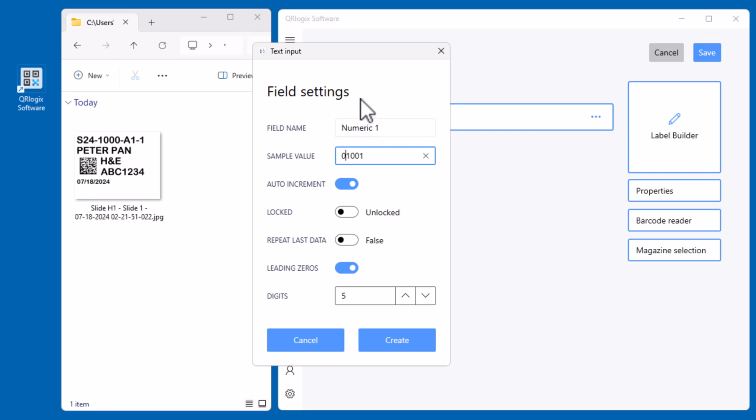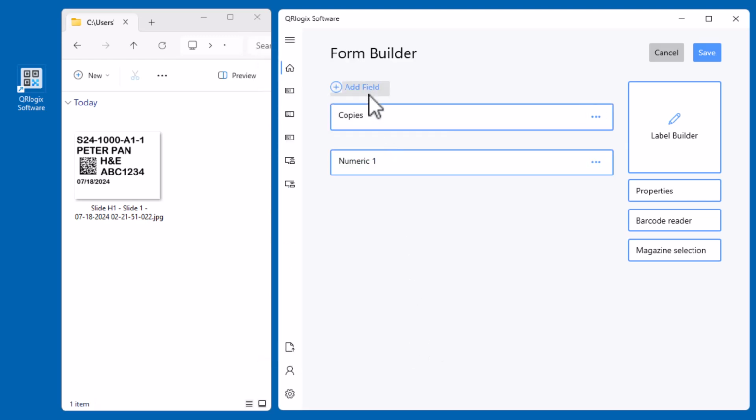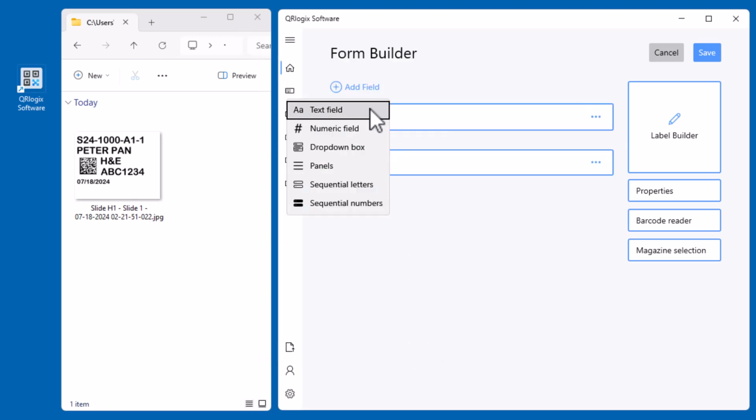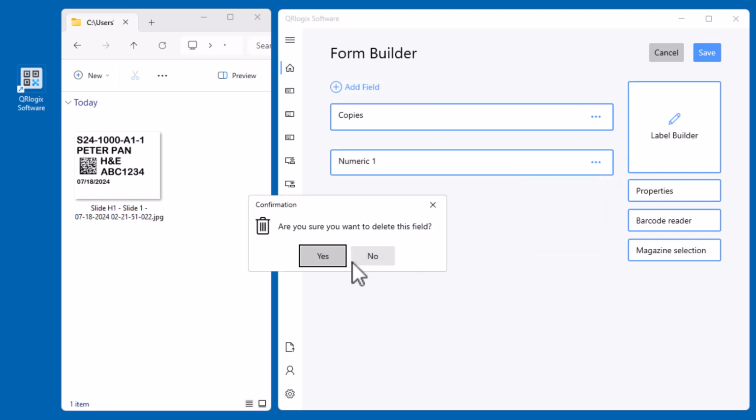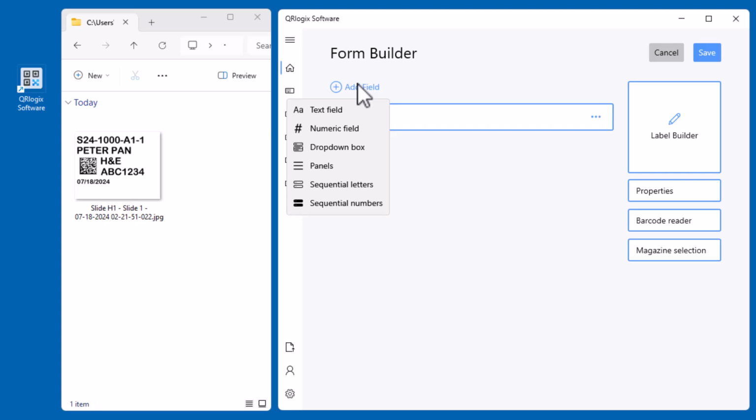I would avoid them when they're not needed. Instead, use a traditional text field. So let's go ahead and remove this, because we didn't need to do that. And let's talk more about these. We've also got drop-down boxes. Those are great. We're going to use them for our prefix as well as our stain.